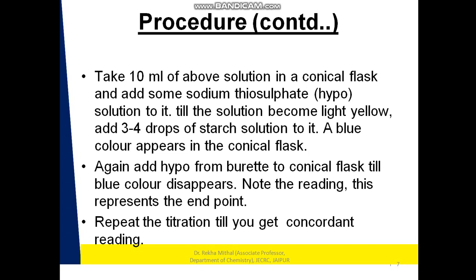Then we have to titrate it with the hypo solution. Then the blue color disappears. Note the reading. This represents the end point. End point is that point where the reaction is just completed. So we note down the reading and repeat the titration till we get the concordant reading, that is we get the same reading in continuation.